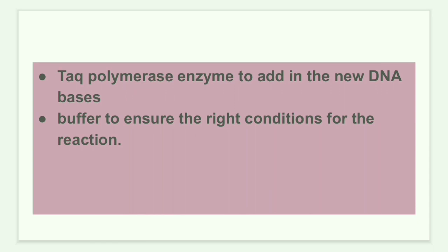We also require a Taq polymerase enzyme. What is the Taq polymerase enzyme? We'll discuss later on. We also require buffer. Buffer is needed to create the right condition for the reaction.